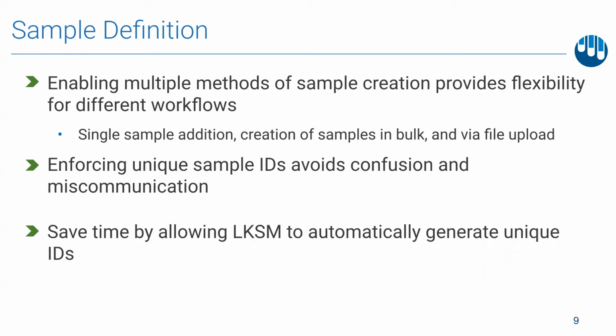Sample Manager enforces a uniqueness constraint on sample IDs to help ensure that samples are distinct, avoiding downstream confusion about a sample. It helps save time during the registration process by automatically generating unique sample IDs using our naming pattern tool.